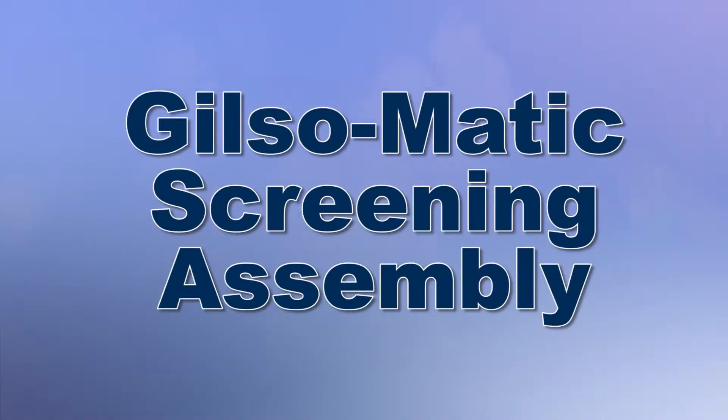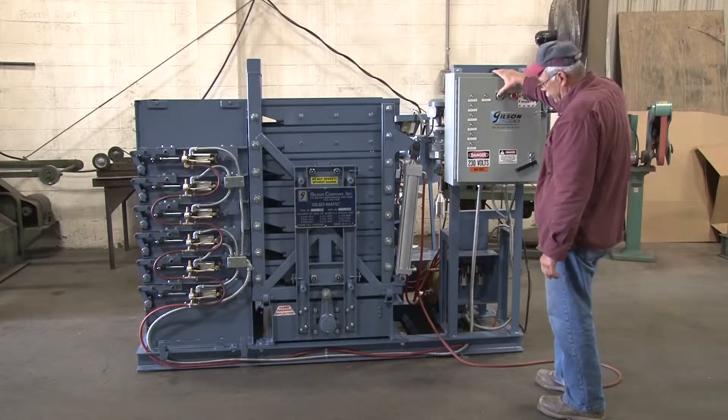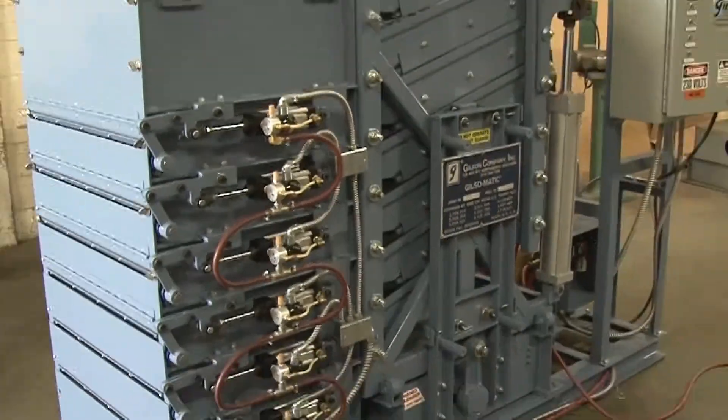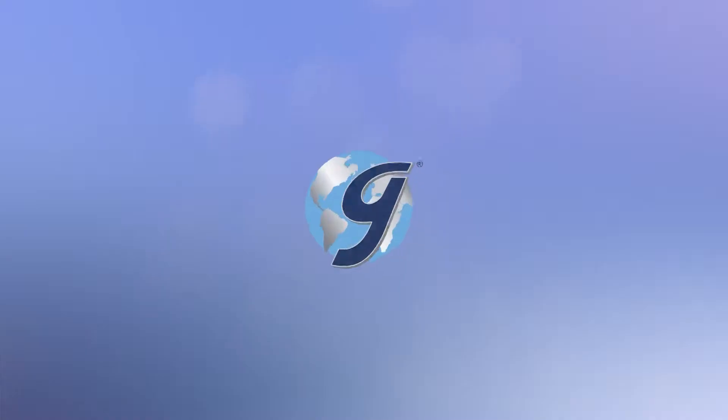The unique capabilities of the Gilsomatic Screening Assembly, built to quickly process large high-volume samples of coarse-grain materials, make it the most accurate, efficient, and reliable in-plant particle sizing system on the market today.